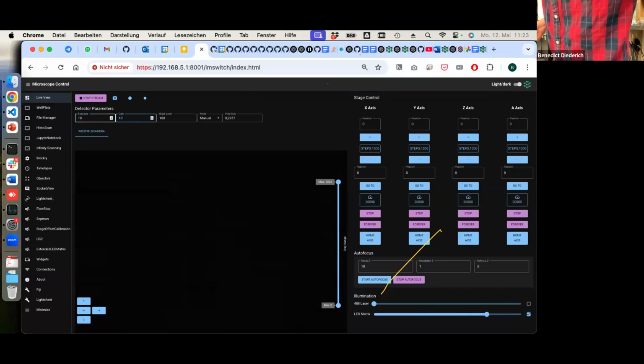This here literally follows the idea of having a light sheet. So that everybody can see that, this magic cable here is a laser. Right now it's off, so don't worry. The laser is held here, fanning out, and in order to collimate it so that it's parallel light again, you have to place the lens where its focal length is, where the focal point is here.